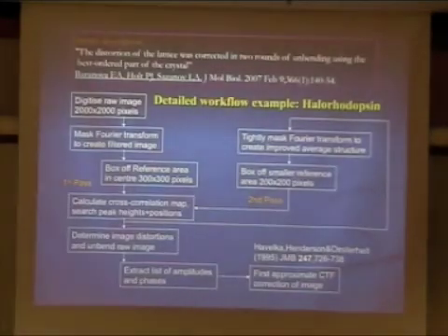So that's it. Now this is the last part. Basically, what I'm trying to say here is that for the unbending protocol, everybody has a slightly different idea of how to do it. But it has become pretty stable. That's why we can use the standard scripts in 2dx to do a reasonable unbending. If you look at a recent article, the description of what they do is very short. If you are looking for detail of how people have been doing their unbending, you need to look at an earlier paper. And oftentimes it will have a detailed description of how they deal with their particular images.